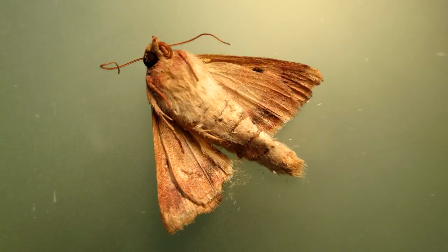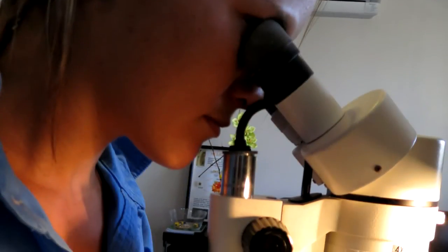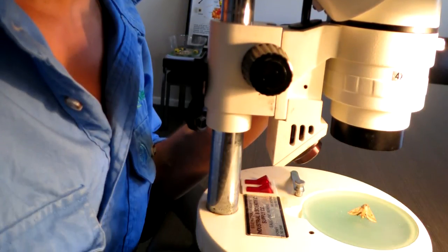The next morning you may wish to examine the dead moths using a hand lens or microscope as an additional classroom activity. If you don't wish to do this, you can simply discard your moths and eggs in the general waste.